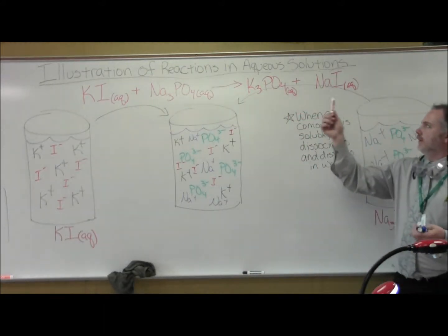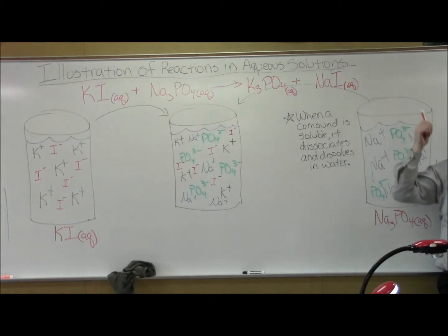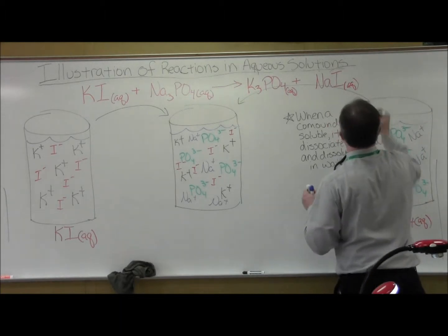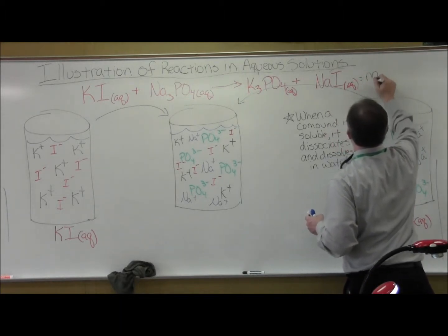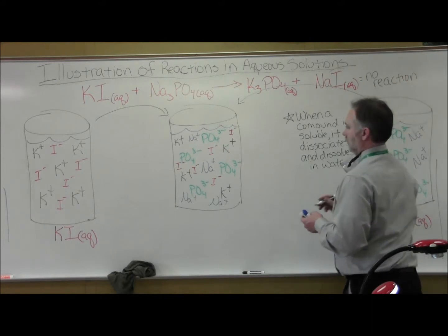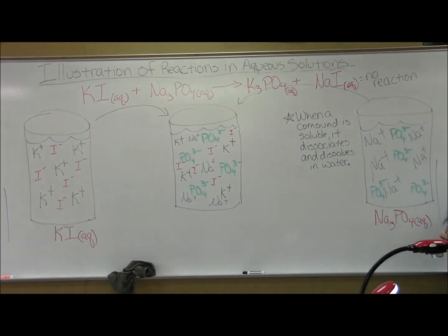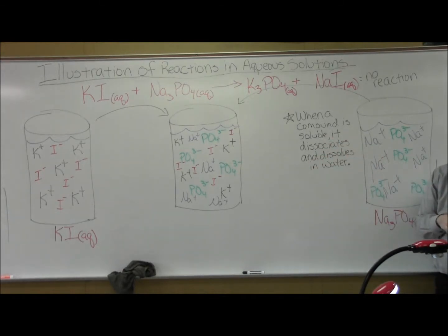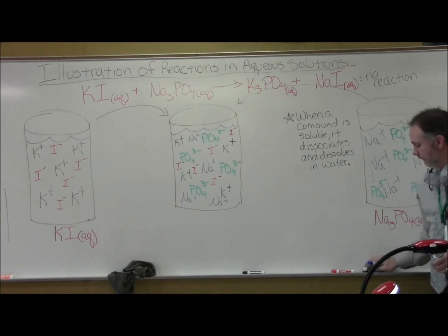And Griffin, what do we say happens when both my products are soluble? So there's supposed to be no reaction. Exactly right. So what's supposed to happen when I mix these two solutions is nothing. So let's check that out.